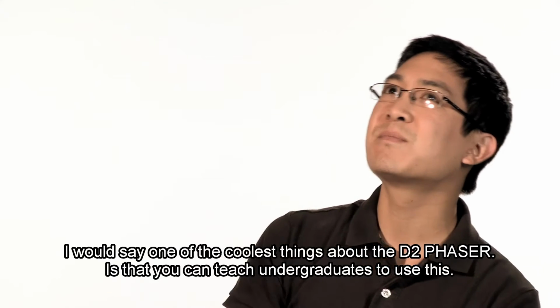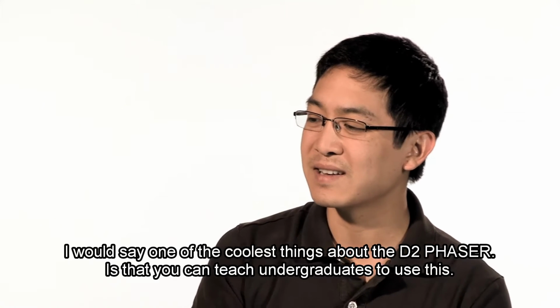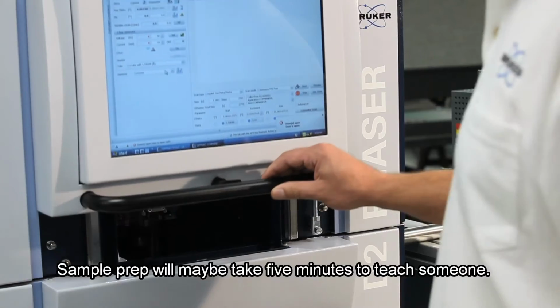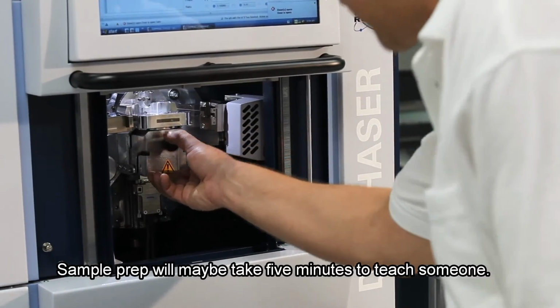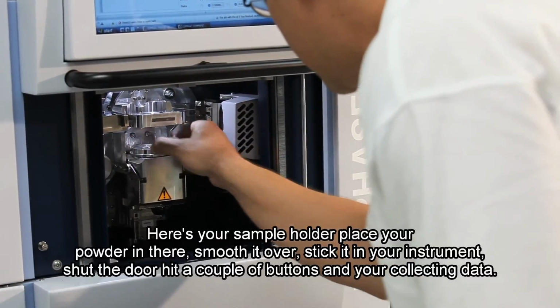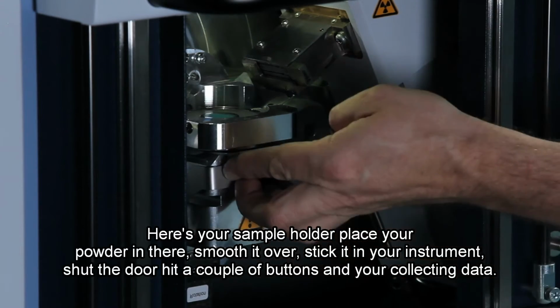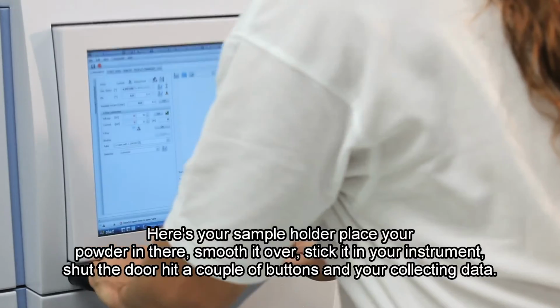I would say one of the coolest things about the D2 phaser is that you can teach undergraduates to use this. Sample prep will maybe take 5 minutes to teach someone. Here's your sample holder. Place your powder in there, smooth it over, stick it in your instrument, shut the door, hit a couple of buttons, and you're collecting data.